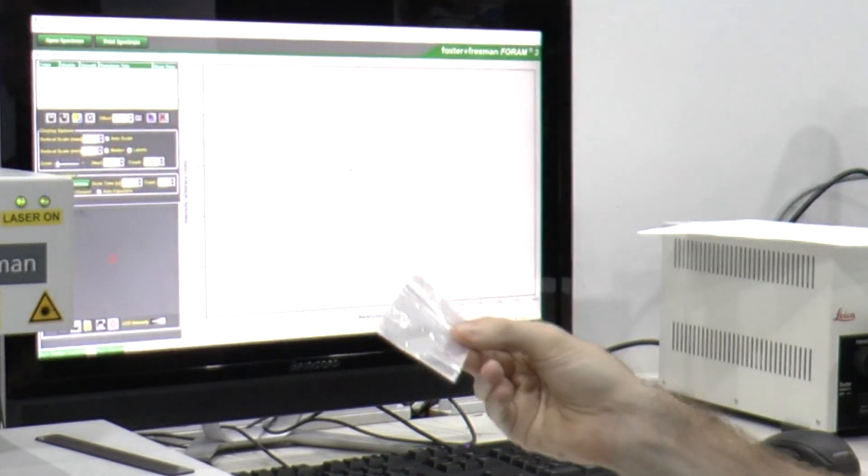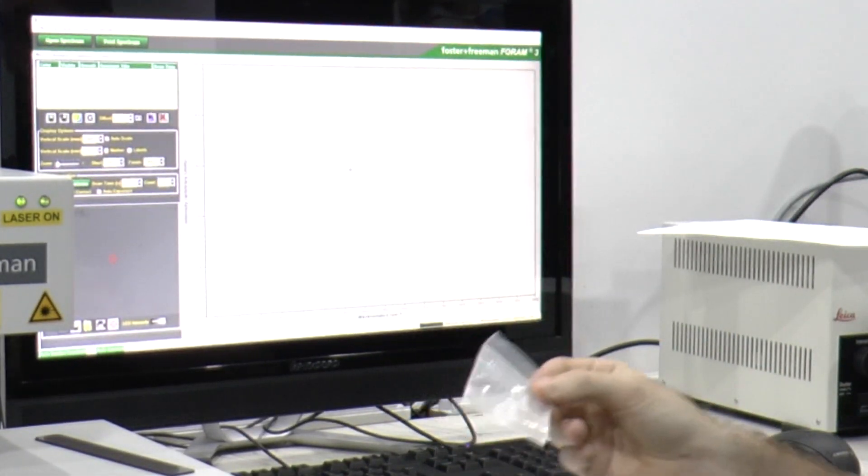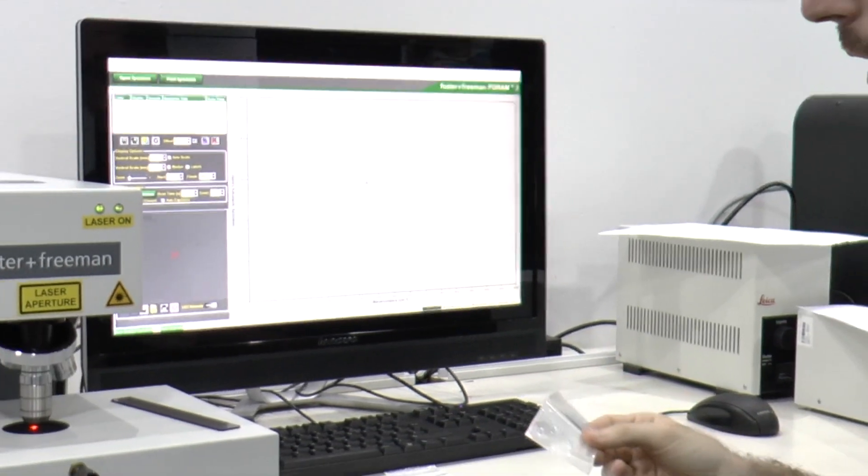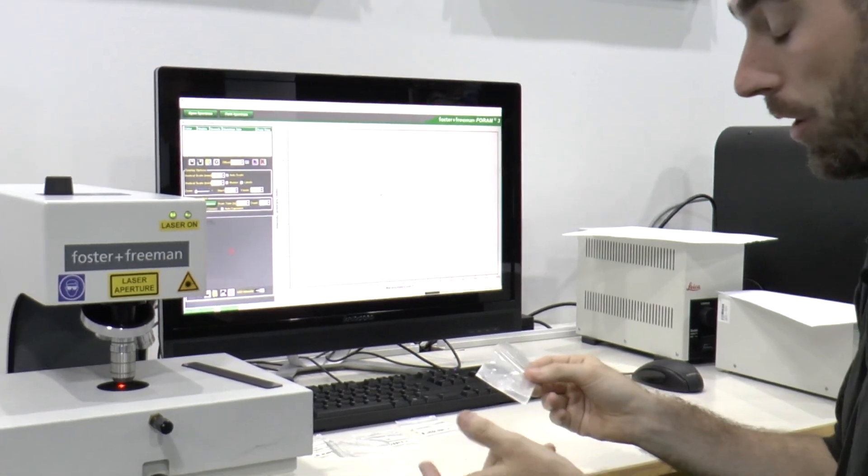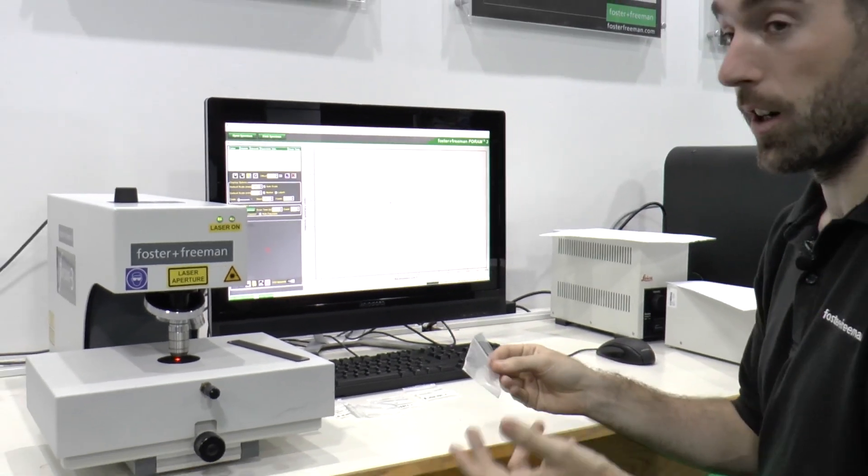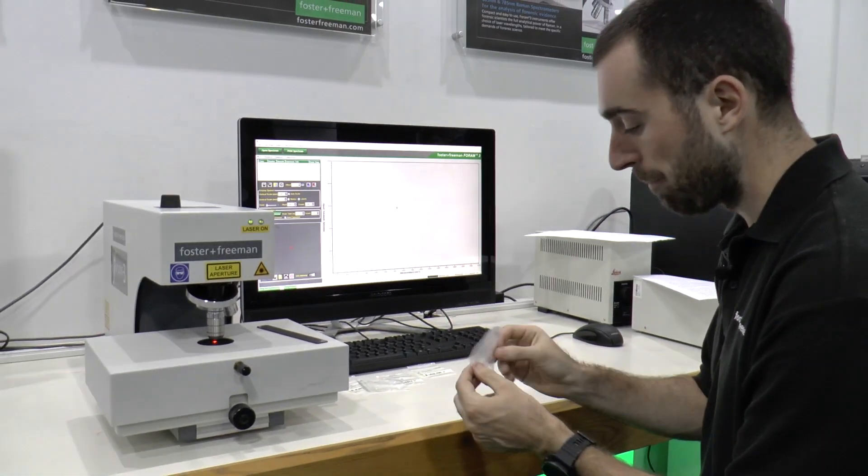We will analyze this and then use the databases that we have on this system to try and identify it.